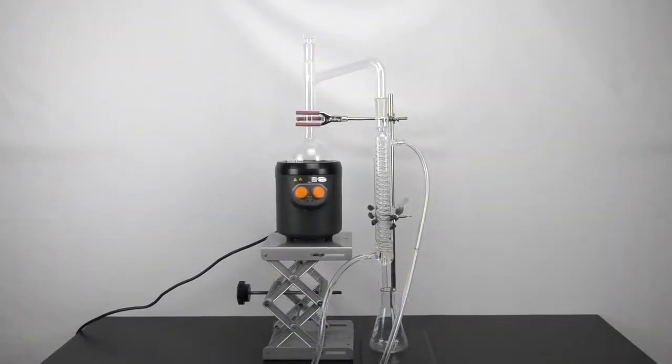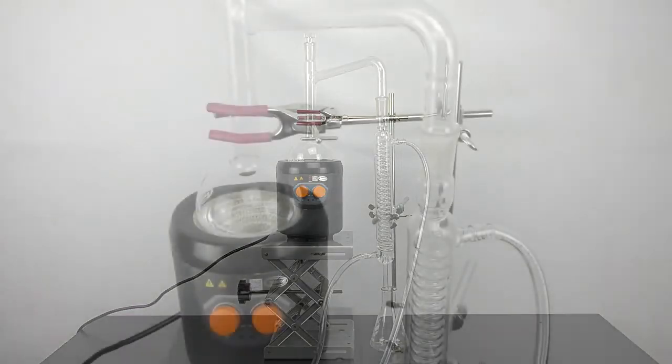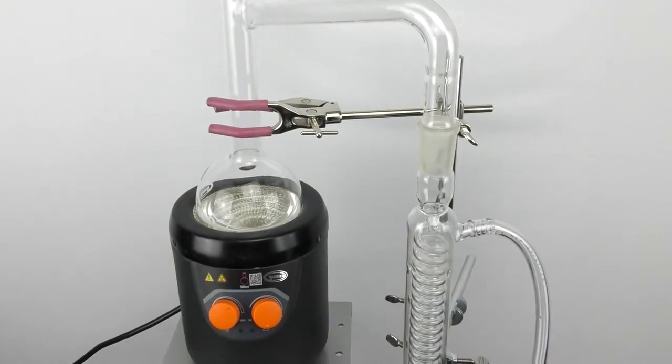Here is the complete setup and I just put in a mixture of isopropyl alcohol and water to do a simple distillation experiment. I'm just starting to see the beginnings of some bubbling.